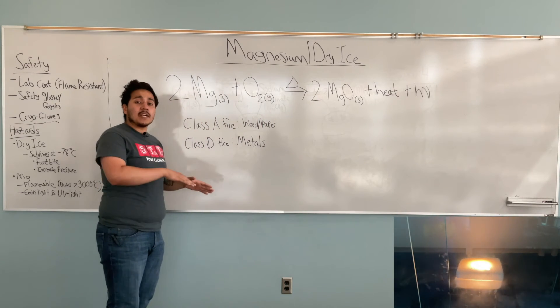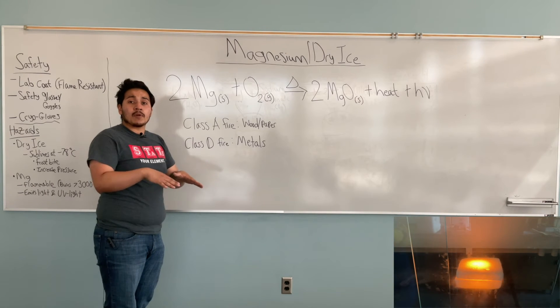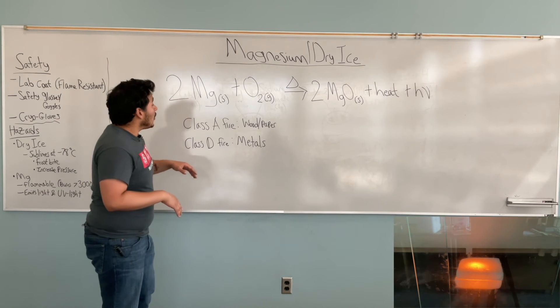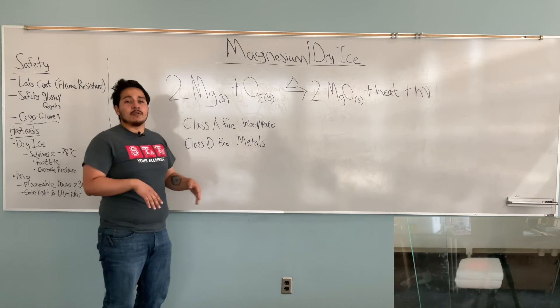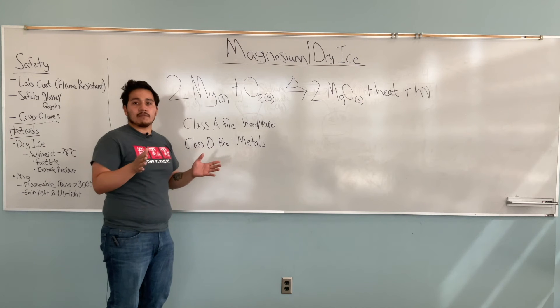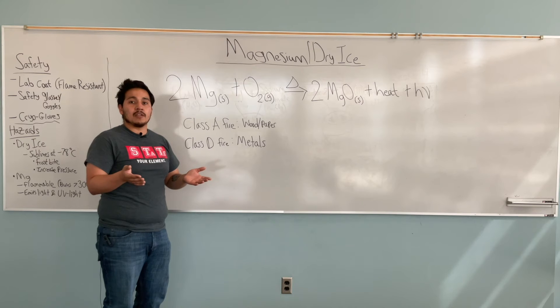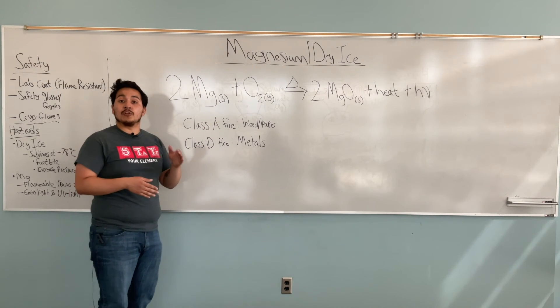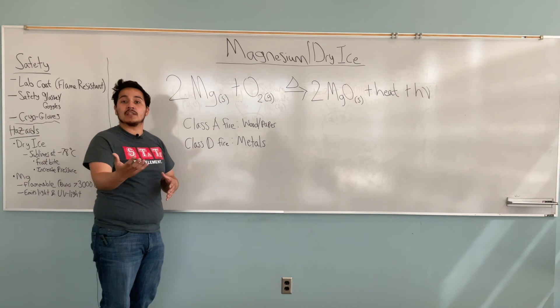As you saw, when I put the second block of dry ice over the reaction, it still kept reacting. The reason for that is because for Class A fires — like wood or paper — you can use a fire extinguisher that has purely carbon dioxide to put the fire out. But in this case, because there was a lot of carbon dioxide, especially dry ice, the magnesium kept burning. That's because magnesium will reduce carbon dioxide into carbon and oxygen, which is the fuel needed to keep burning.